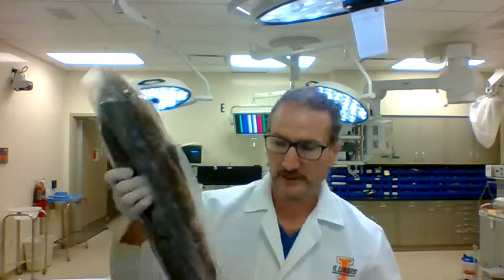If you're at a sink and you feel like rinsing a little bit, you can. But when you bring this back to your table, make sure it's in the bag. Don't just walk across a room or anywhere, even outside, with the stuff dripping, because you're going to kick it. You're going to get down on the floor. It's going to be a mess. So you're going to cut across here. You can drain the juice out.